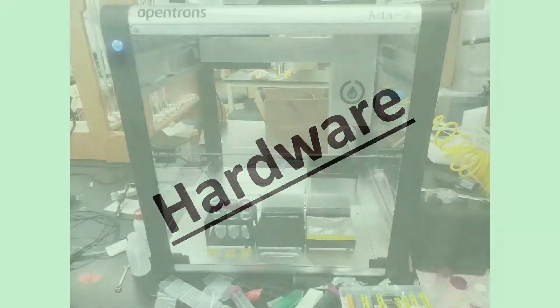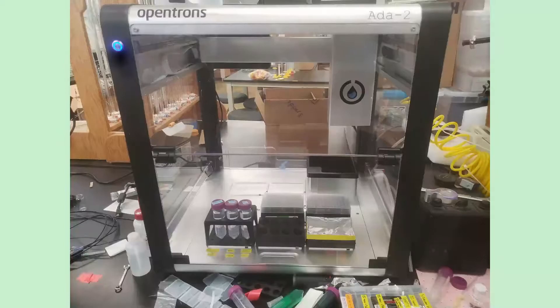Let's get into the hardware. Here I have a picture — excuse the clutter — but this is ADA, our OT2. As you can see, it has a bunch of stuff inside: a big box hanging on top, tubes, vials, pipette tips. We're going to go through and figure out what everything is.